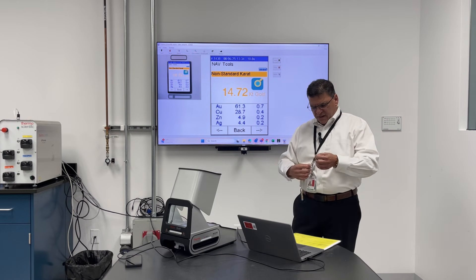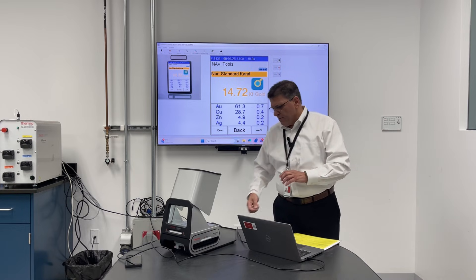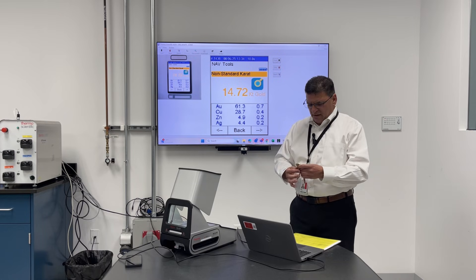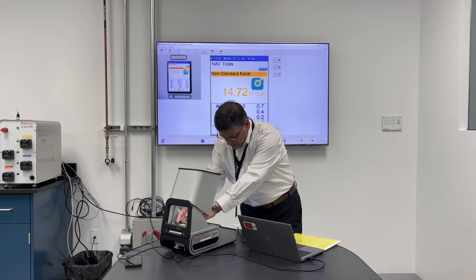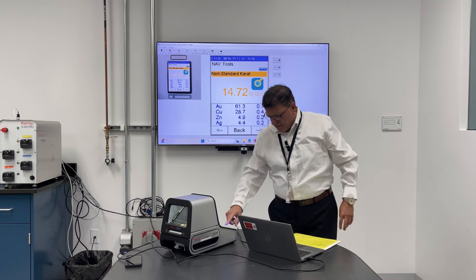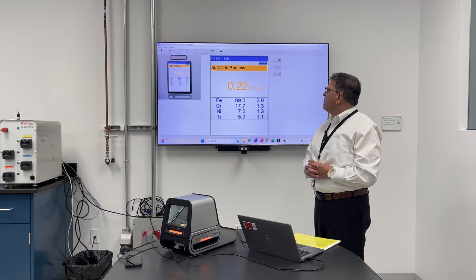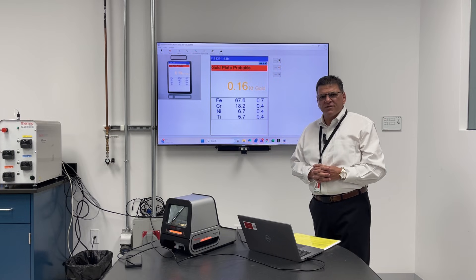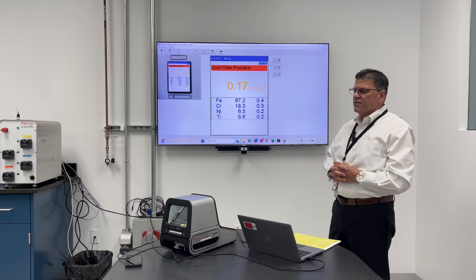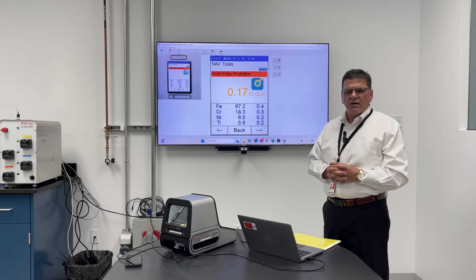Not all that shines is authentic. There are a number of counterfeits, and although this piece looks very similar to a gold item, we can put it under the same test. Straight away, within seconds, an audit process tells us this is not indeed 14 carat. You can see there's 67% ferrous content, chrome, nickel, and titanium — those indicate it's not gold on any level whatsoever.